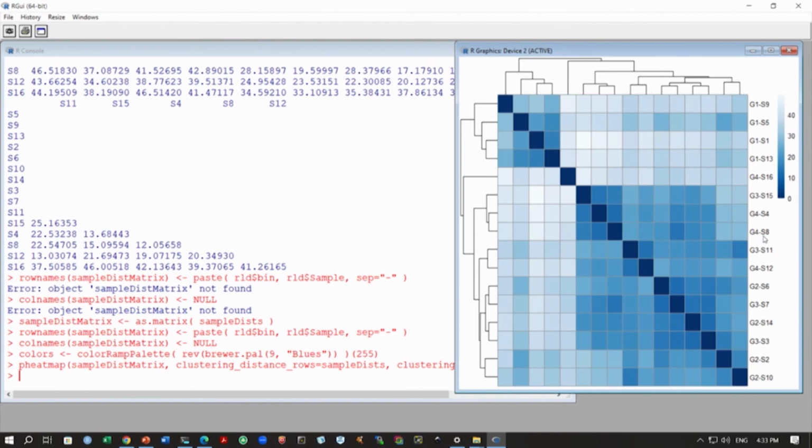Okay. So, in the next class we will talk about the principal component analysis, and we will generate this principal component analysis plot, and once we are done, then we can move into the bias correction part. Thank you very much.